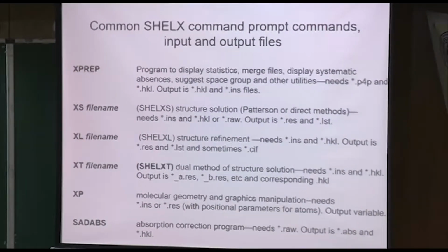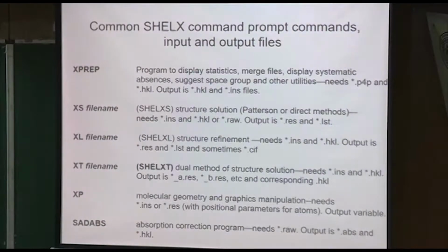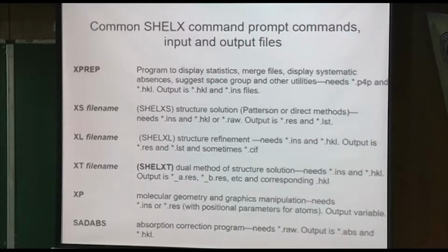You can get it from the SHELX homepage. It's free. There's a 64-bit version and a 32-bit version, and you can just download it and install it on your computer. And you may have to sign up as a user, but there's no big deal involved. It doesn't cost anything. He just wants to know the names of all the thousands of people that use his software, and then you can download it. So go to the SHELX homepage, and there are also manuals and other frequently asked questions there. There's a lot of good stuff.